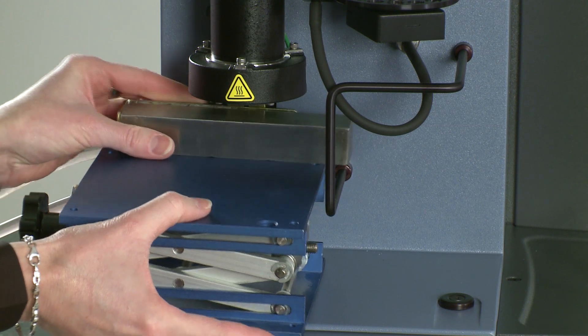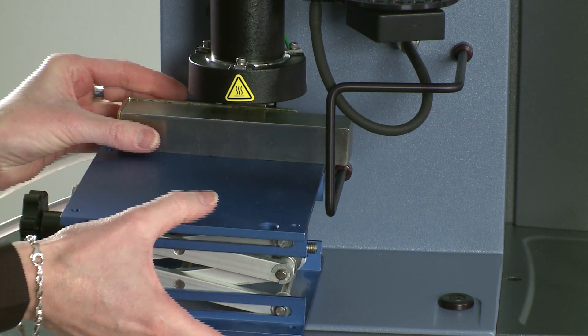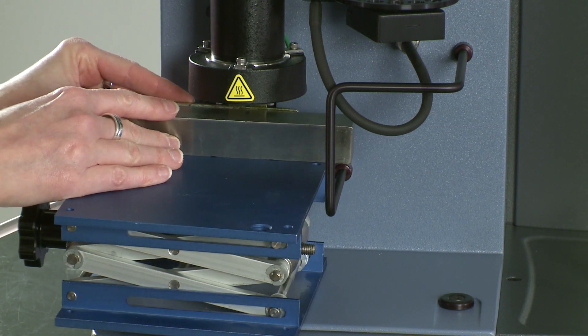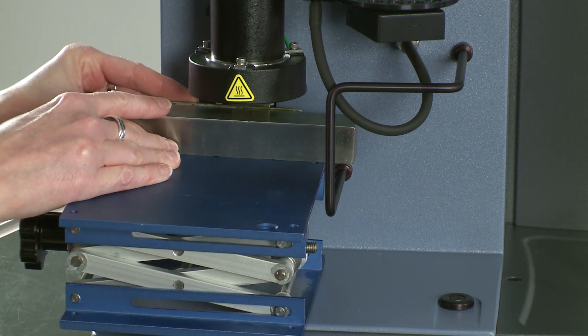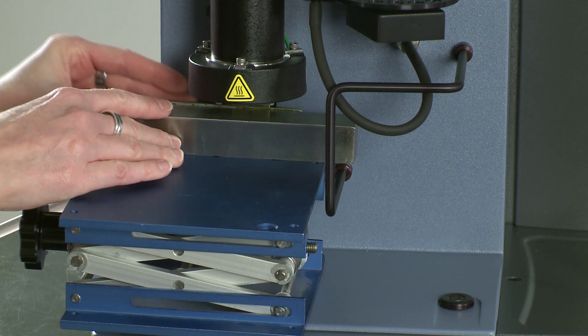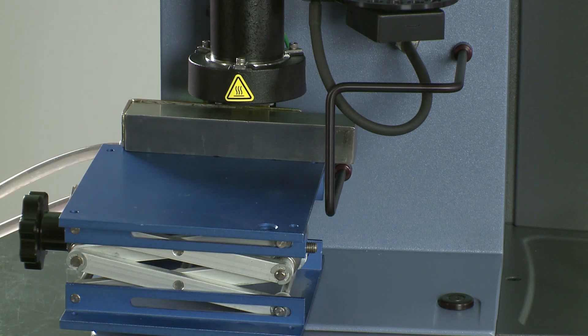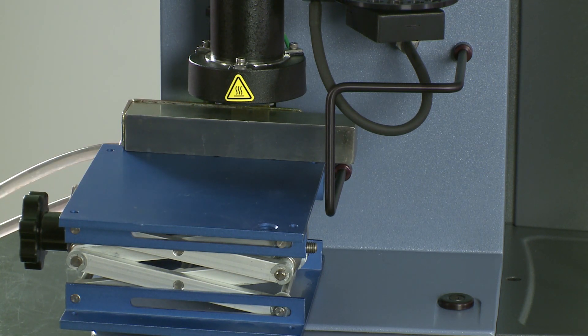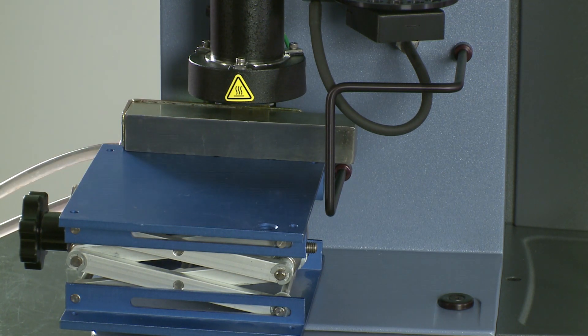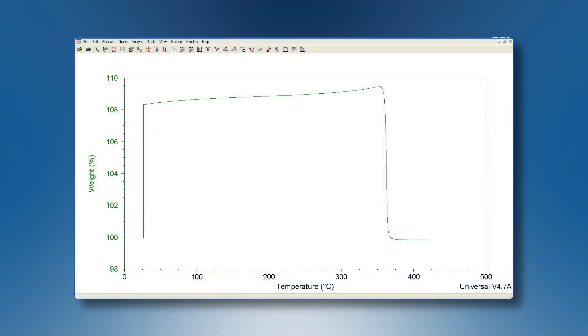Observe the real-time signal display and move the magnet in such a position that a maximum in weight gain is going to be detected.